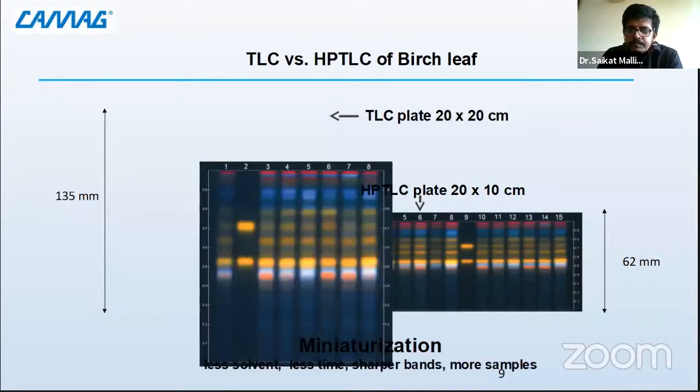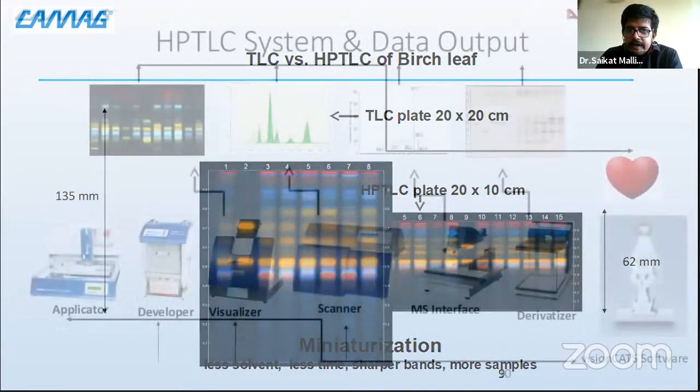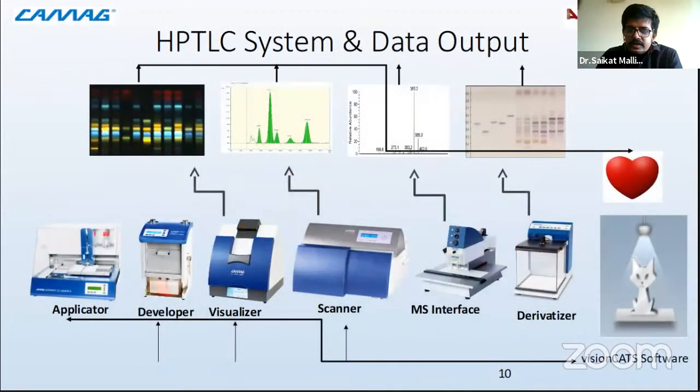So, let's move ahead and let's see what a typical HPTLC setup looks like. Now, I want to brief this technique previously because when we move into the actual application part, that is where you will be able to correlate this and understand how it materializes.